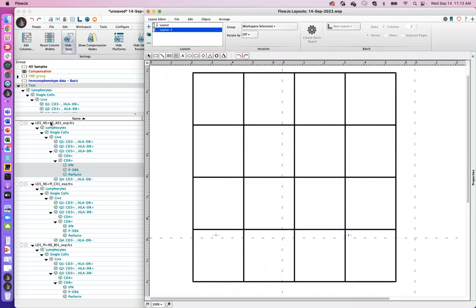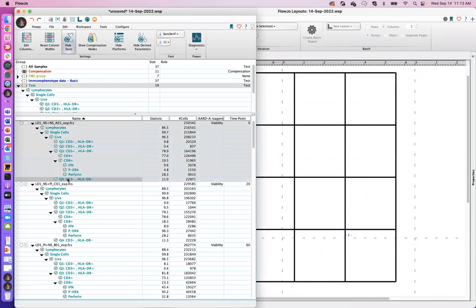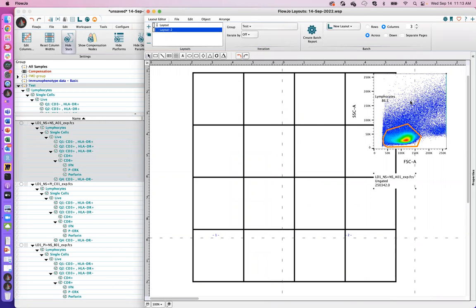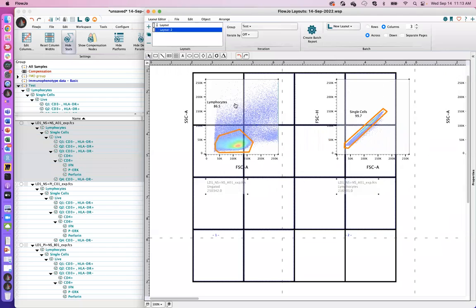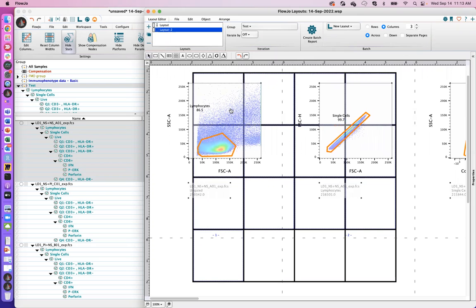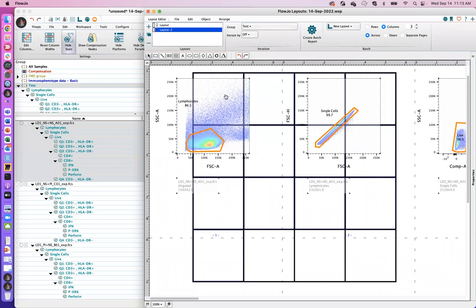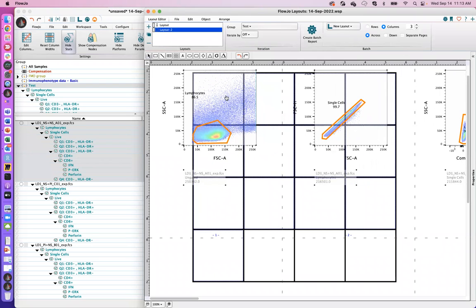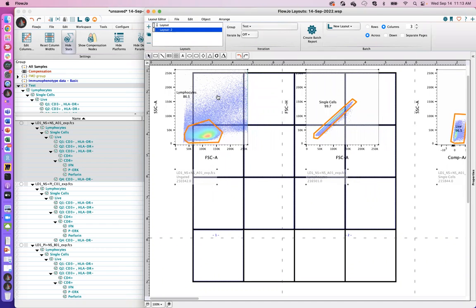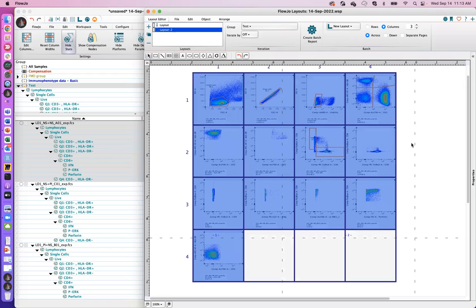Okay, so now what you can do is you can take your plots and you can drag them either directly into the grid, or my favorite option is to kind of put them off towards the side and then drag them into the sort of upper leftmost corner. And you can't really see it very clearly, but whichever plot you're sort of leading with, just make sure that you drop it over the left-hand corner of your grid, and it'll drop everything in there.